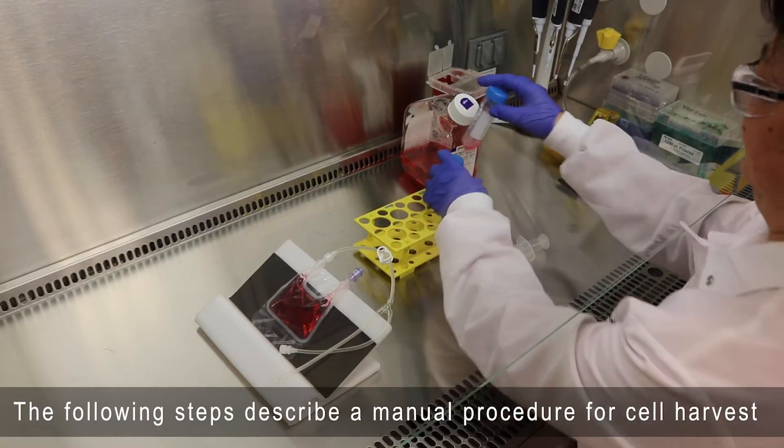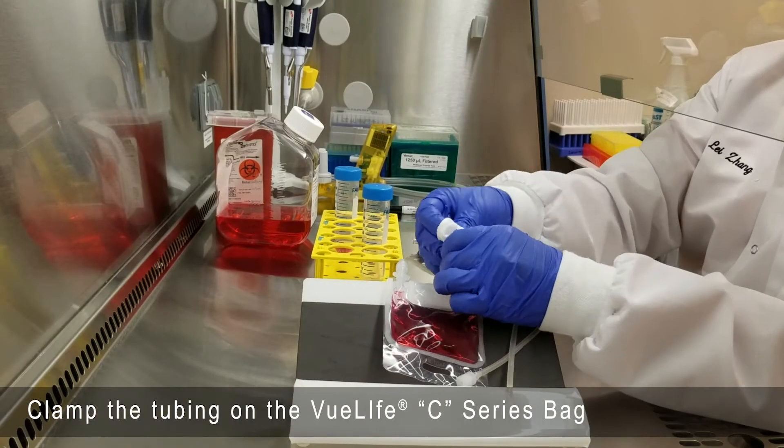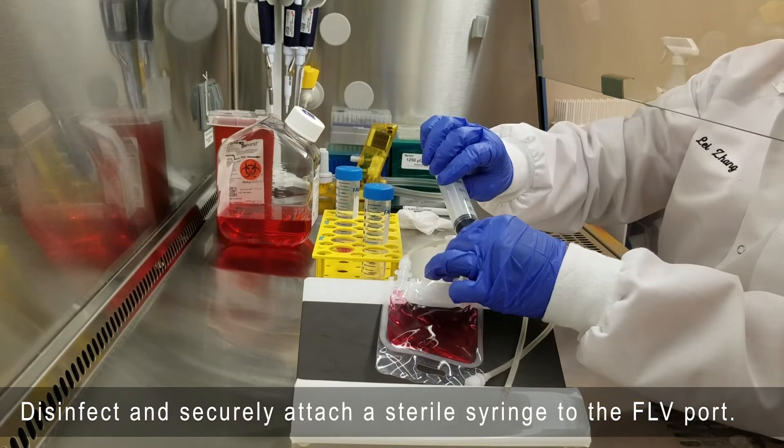The following steps describe a manual procedure for cell harvest. Clamp the tubing on the ViewLife C-Series bag. Disinfect and securely attach a sterile syringe using the FLV port.